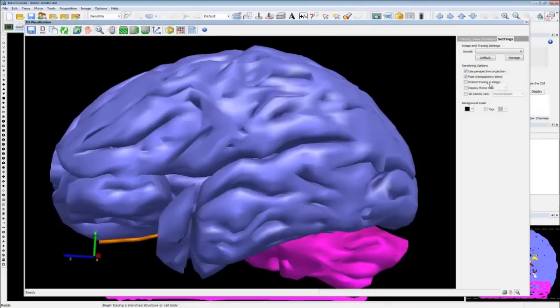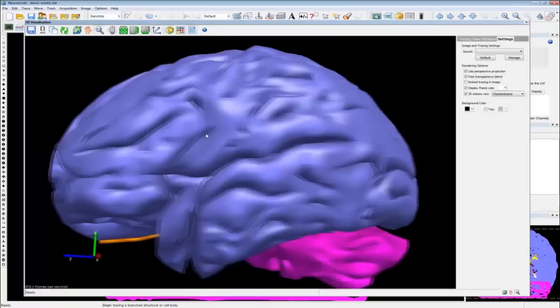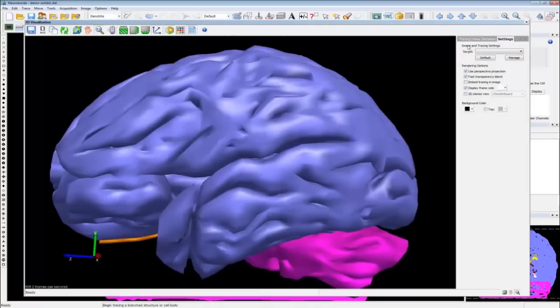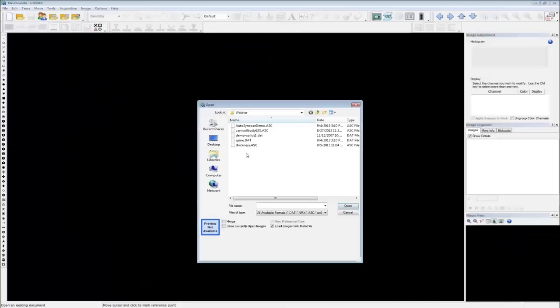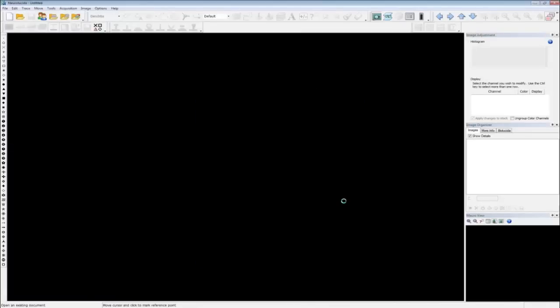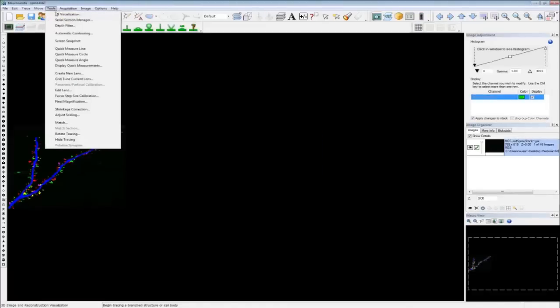You can embed tracing into image data, display the frame rate, and change the background color. There's also a new 3D viewing feature using 3D glasses and a 3D monitor — come by our SFN booth to see reconstructions in 3D, where you can look as if you're traveling along a dendrite or axon. You do need special hardware for that. Now let's open the spine data with image data in 3D Visualization. When first loaded, a slice view is displayed — just one single image plane — to keep loading fast.